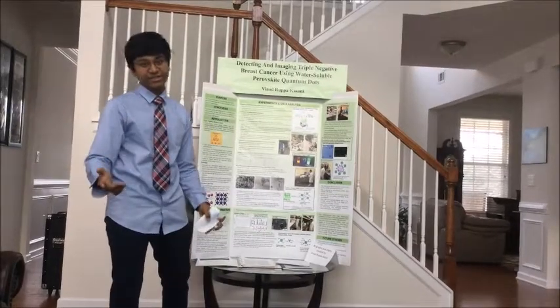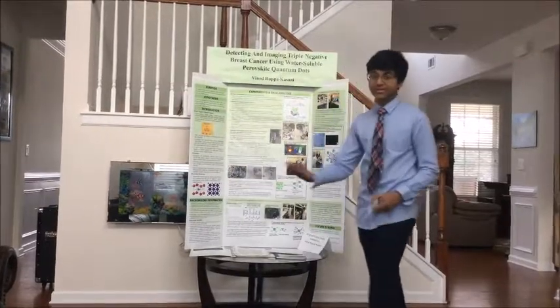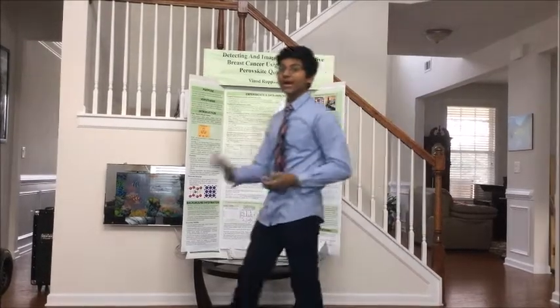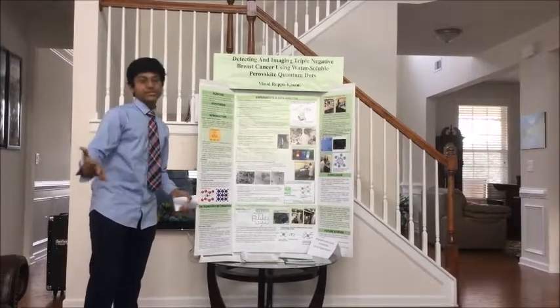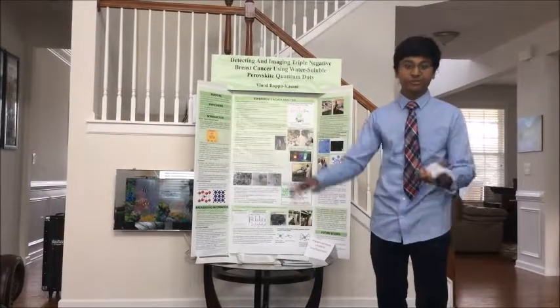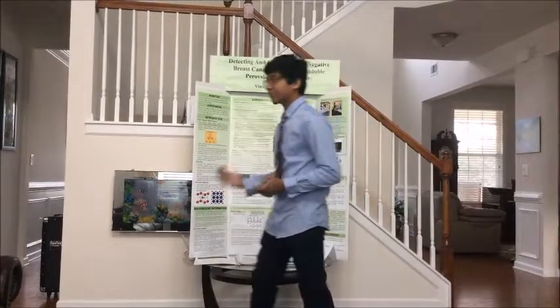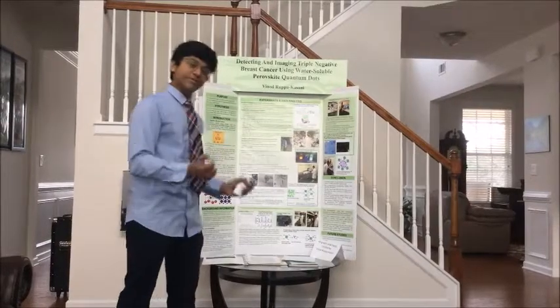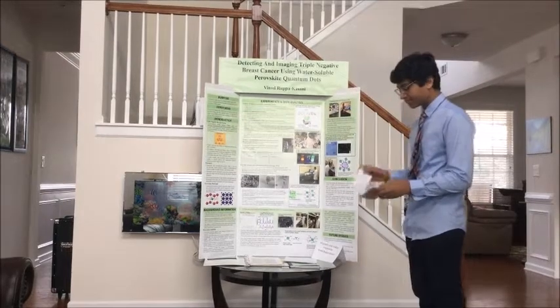So now I'll be getting into my side experiment, just to test the specificity of my perovskite quantum dots, and this is with HaCaT skin cells. I basically did the same experiment, but with HaCaT skin cells, and there was no fluorescence at all. It was just a black image, and that shows how the perovskite quantum dots didn't crowd around the HaCaT cells. Nothing really happened. And that shows how my perovskite quantum dots with the anti-CD63 antibody are really crowding around the exosomes, and it's working specifically for the triple-negative breast cancer exosomes.